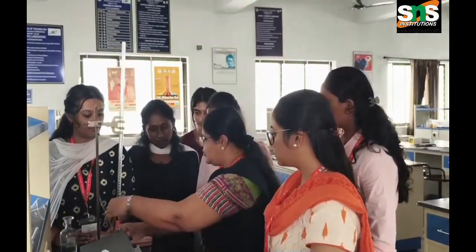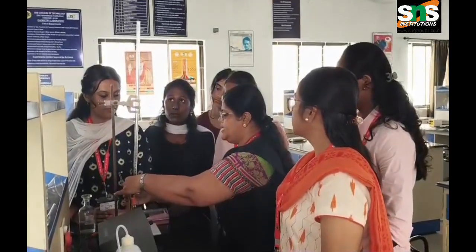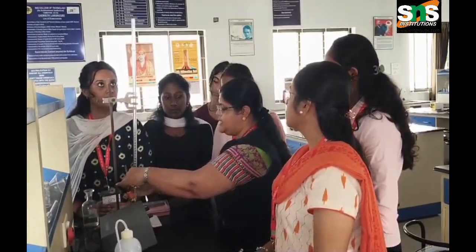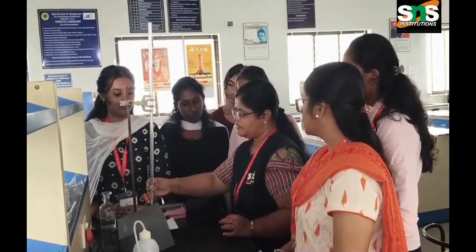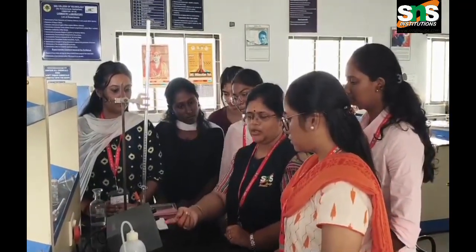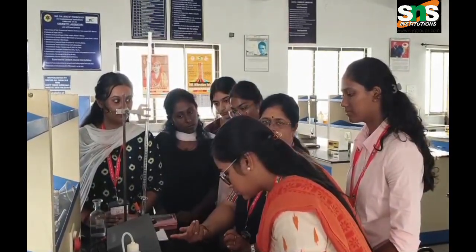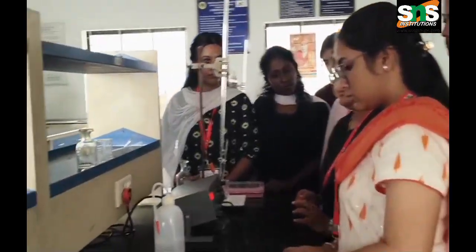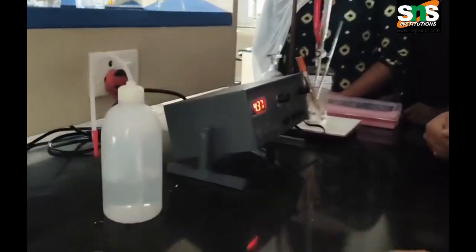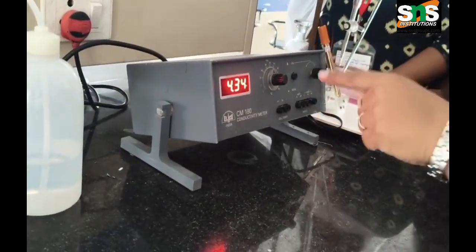Repeat by adding 1 ml of base, stirring the solution, and waiting for the reading to be noted.